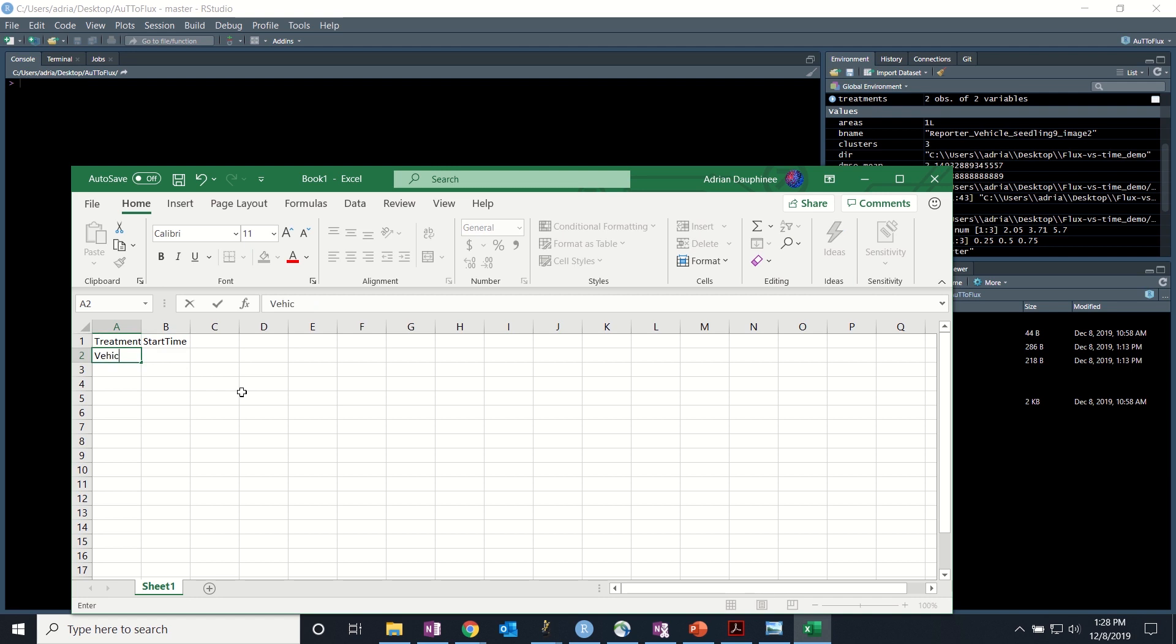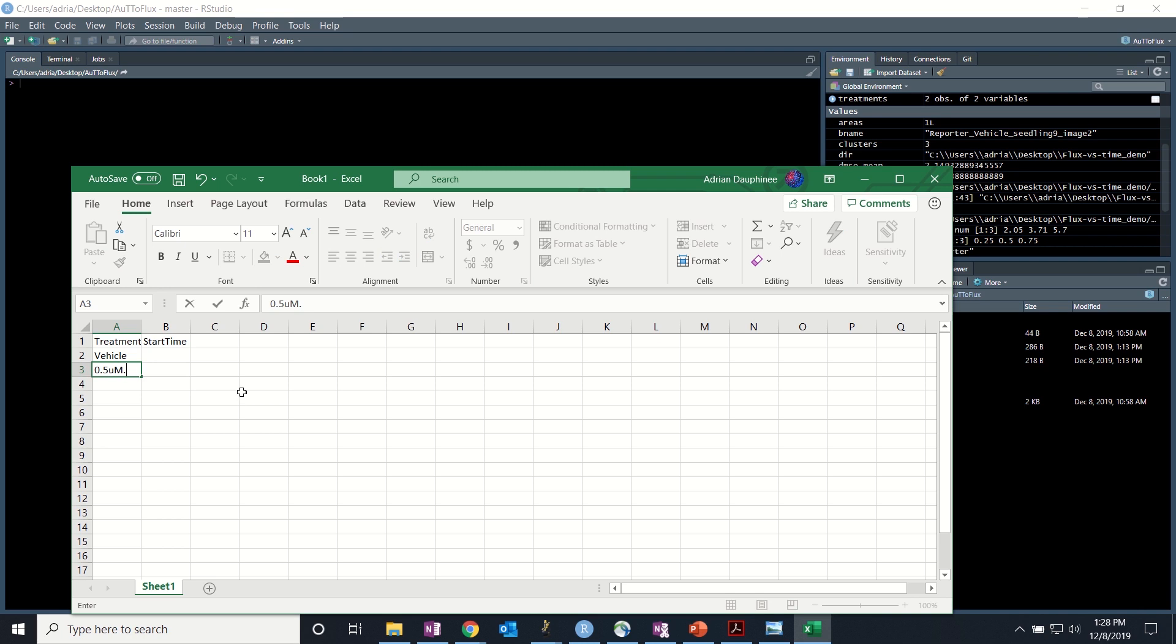The treatment we have is vehicle and the other treatment in this demo file is 0.5 µM AZD. Start times for both of these treatments are as follows.